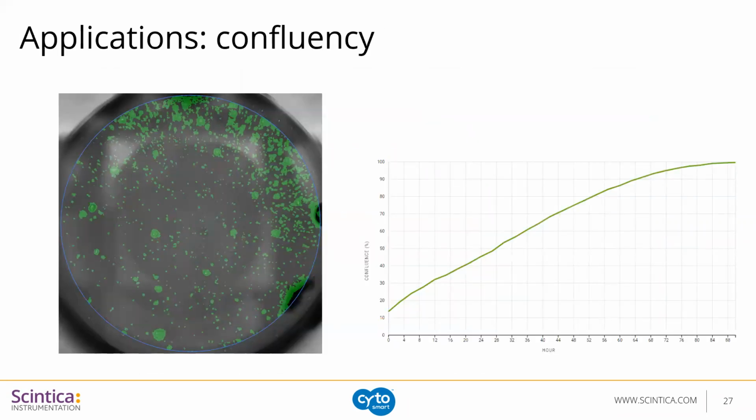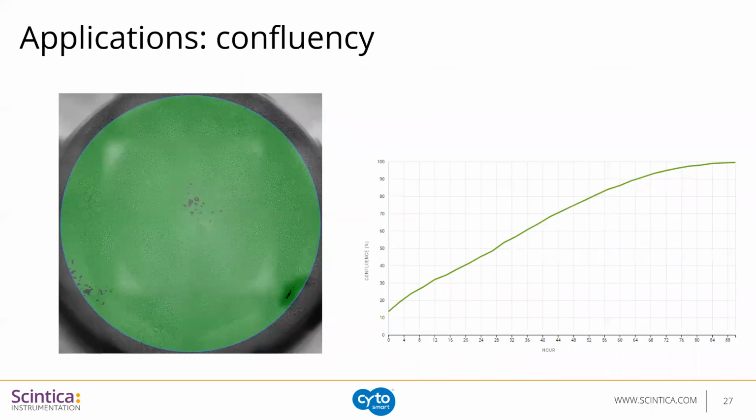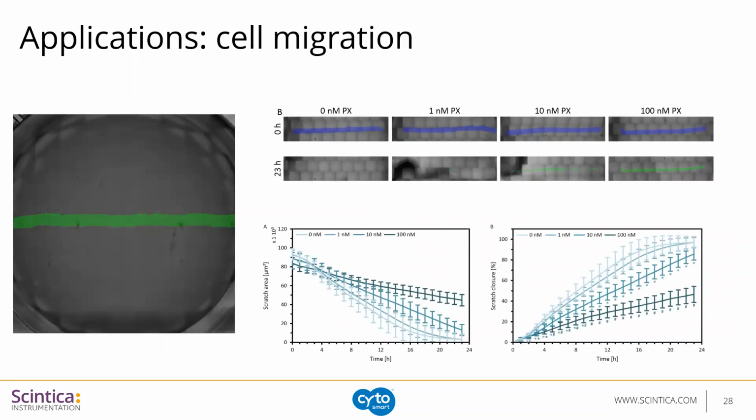In terms of the algorithm, it's similar to the Lux systems where you can look at confluency, and this can be done again either in individual wells or individual field of view like the Lux, or throughput experiments. You can basically compare the confluency across multiple wells or multiple conditions. You can, of course, also use the scratch assay. So here the green line is showing what the software has picked up as the scratch. And then over time, the scratch area will decrease as those cells start migrating towards each other. And again, you can kind of imagine how much data you're able to pull from this when you're comparing wells in something like a 96 well plate.